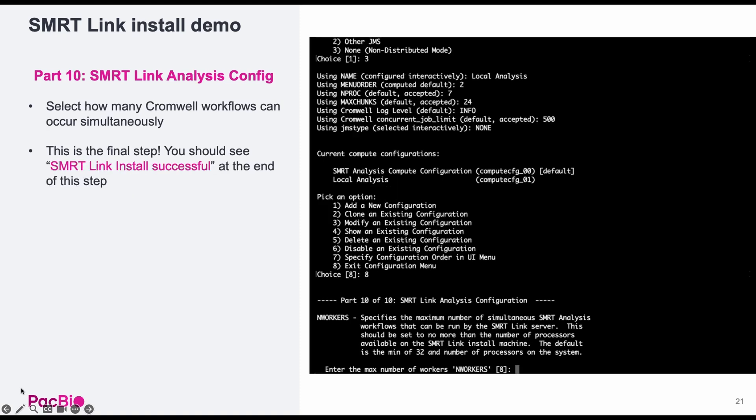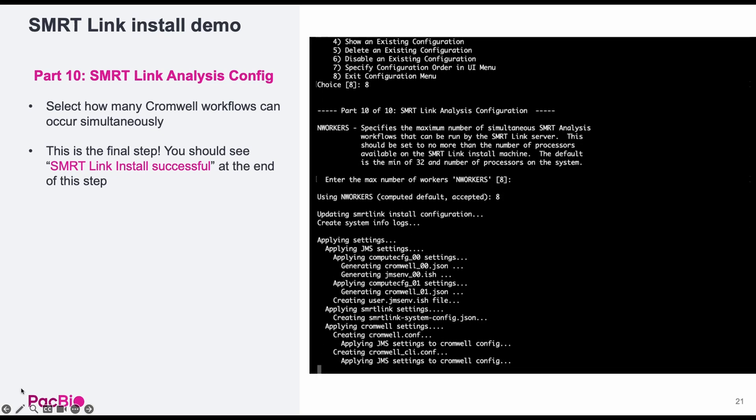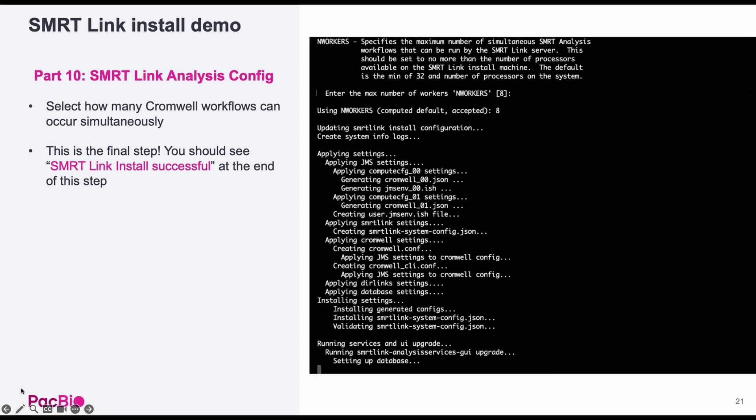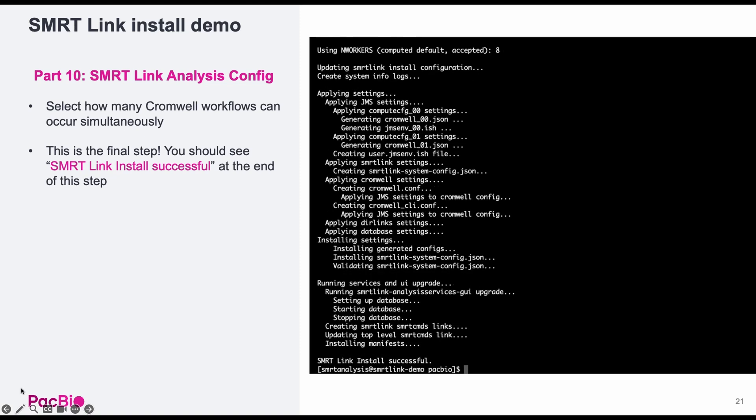Part 10, the last step, simply specifies the maximum number of smart analysis workflows that can be run at the same time. I will be accepting the default of 8. Following this, you will see several lines regarding database setup, and finally, SmartLink install successful.